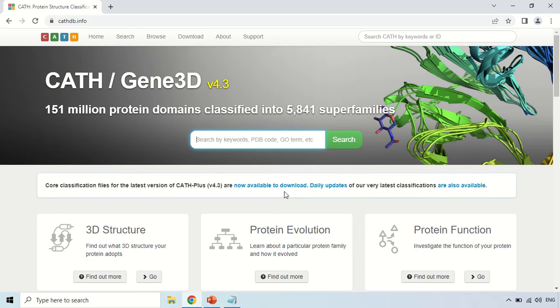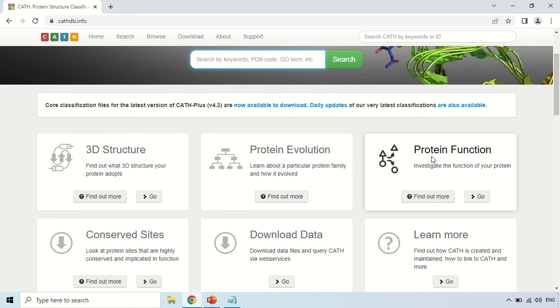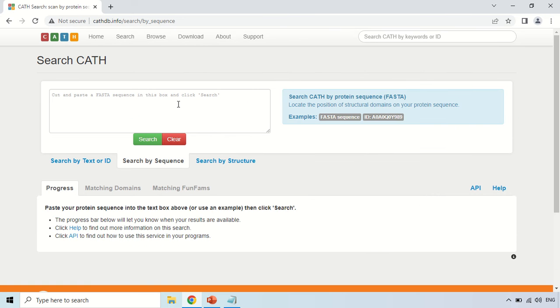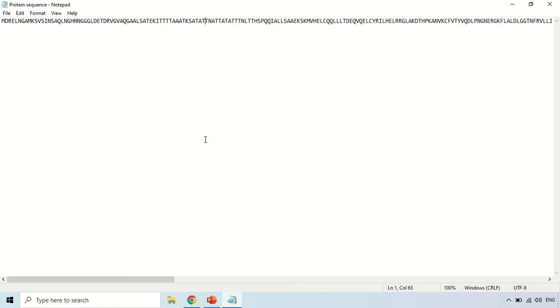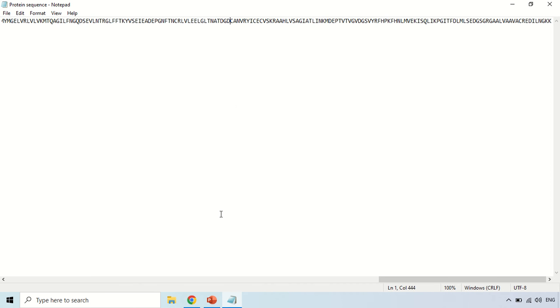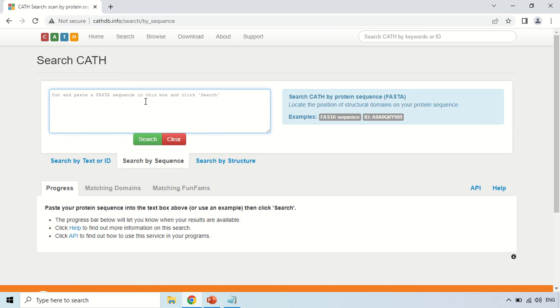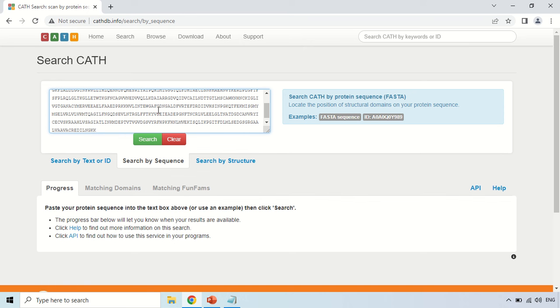To predict the domain in your protein and find its function, click under the protein section and click the GO option. In this section, it is asking for the FASTA sequence of your protein. You can either search by text, by ID, by sequence — if you have your own sequence — or by the structure of a particular protein. In this video, I am going to show you how to search by sequence.